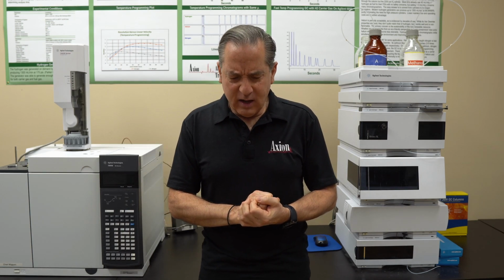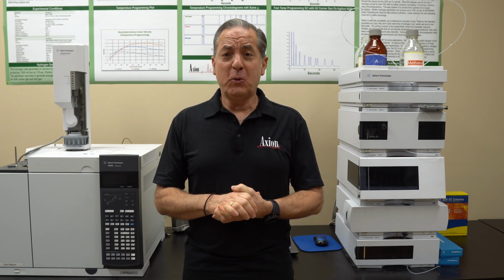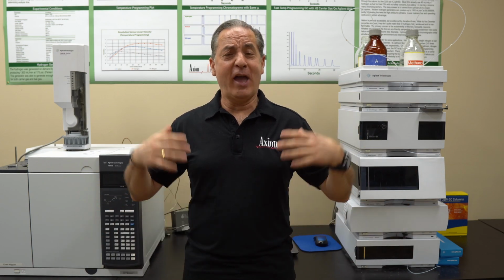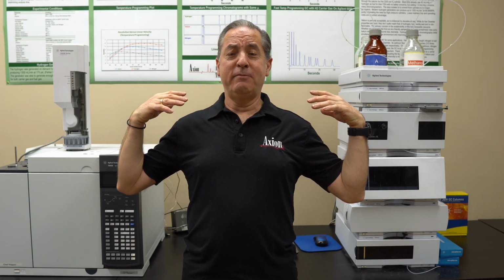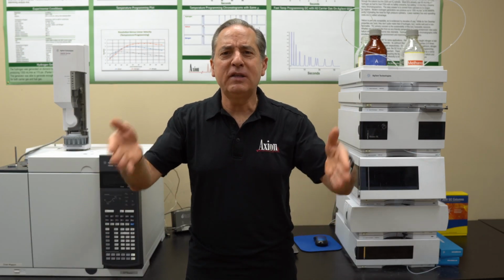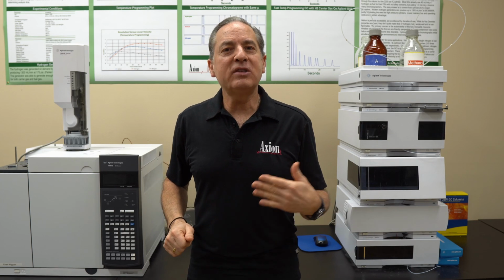One was we had a customer from the New York Metropolitan Museum of Art. So on the very first day when we were doing introductions, I got to that person. I said, "Okay, I'm drawing a blank here. I have no applications. Tell me what you do with HPLC in the art world." And what they were doing was art restoration.